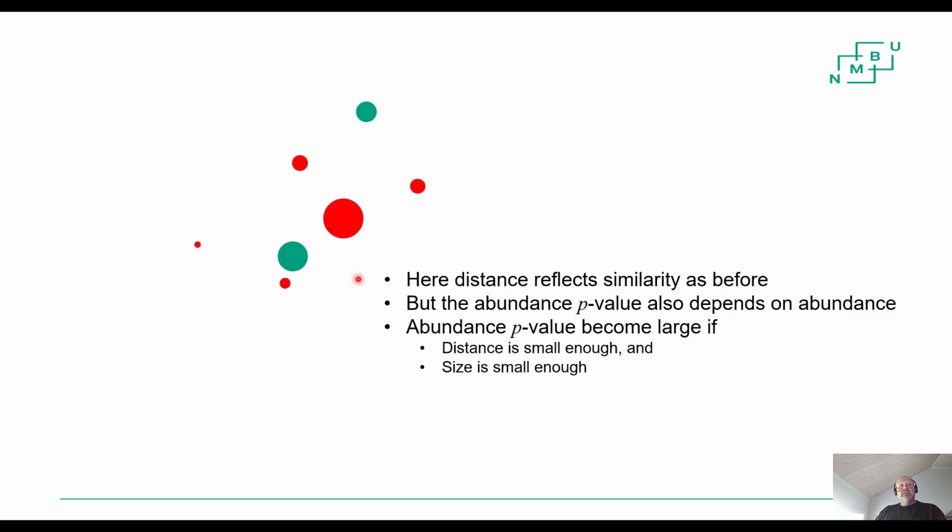So with the data clustering, you can, for instance, get a result looking like this. The red group here, with this as a mother, will include these as children, but not this one. Even if it's very close, it is too big. It's not possible that you can get so many reads coming from this one just by error, right? Because it occurs too frequently. This must be another mother who happened to be very similar to this mother, but it's not a child of this mother. Can you see that? So this will end up as, and this one as a separate group.